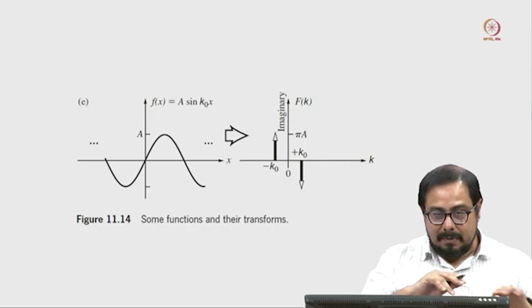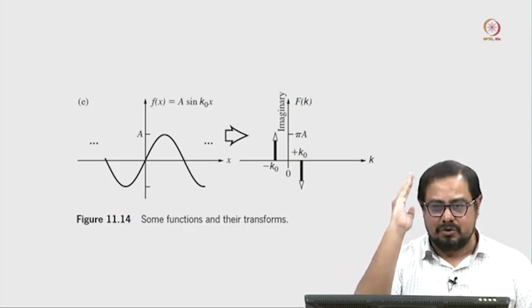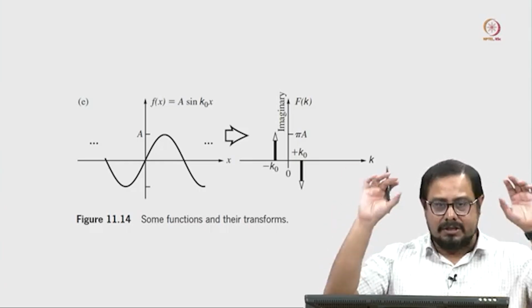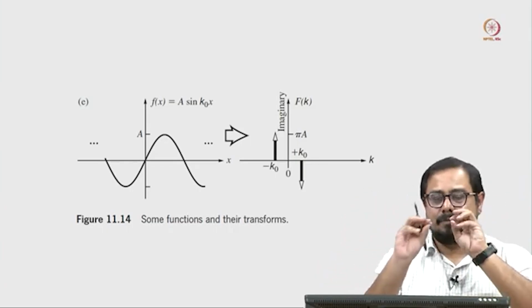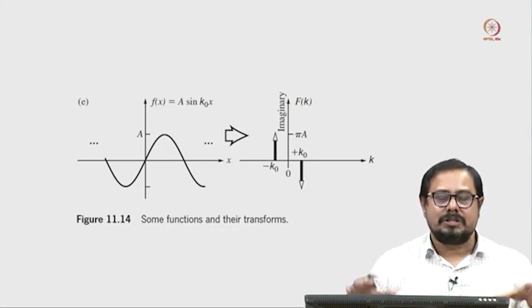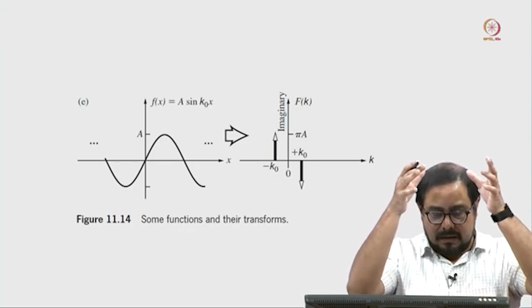Now, when we have multiple sine waves or cosine waves, which have the amplitude there, we are plotting this amplitude square in our diagram or in our images. So, the amplitude squared is represented as a white spot when we are taking those images, and in the electron microscope those things we are recording when we have the microscope.